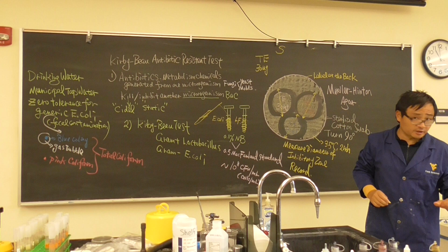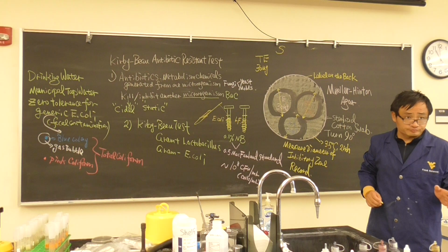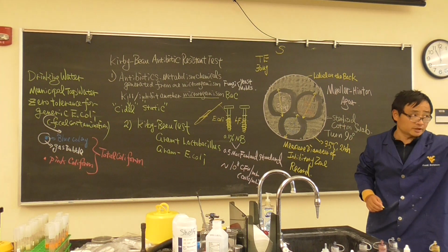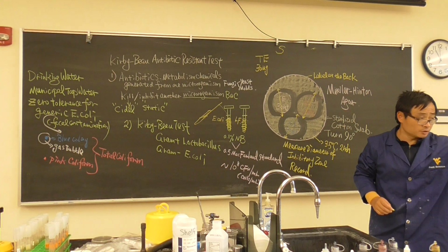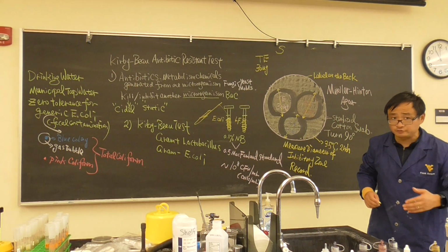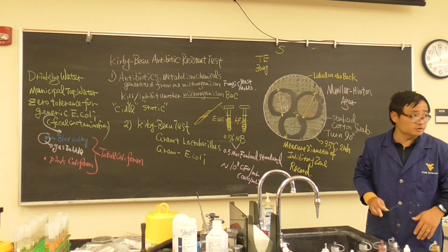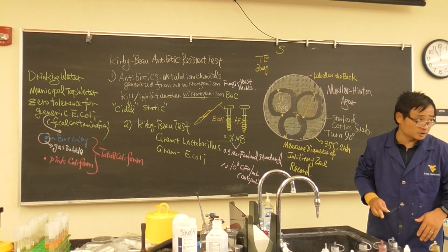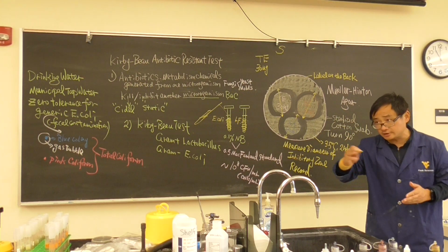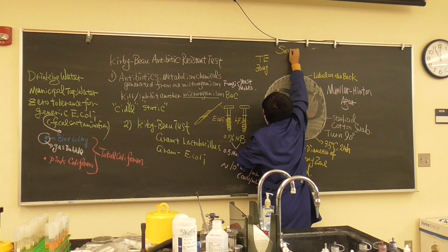We don't say sensitive for antibiotics, because some of you are allergic to penicillin. We say we are sensitive to penicillin. Let's say Madeline cannot take a muscle injection of penicillin, so we say Madeline is sensitive to penicillin. When we do penicillin, we have to do the skin test. If swelling comes out after 24 hours, it means you are allergic and sensitive to penicillin. So at that moment, we use the word sensitive. Here, for bacteria to the antibiotics, we call it susceptible. We don't say sensitive.